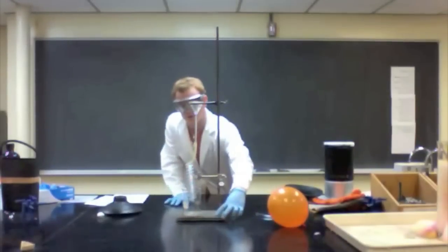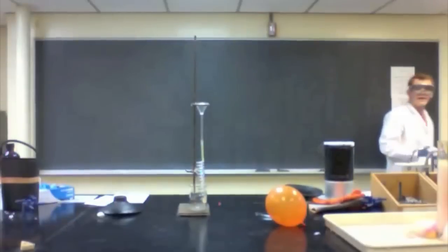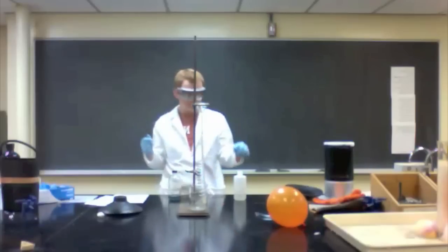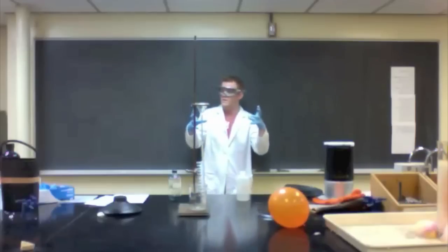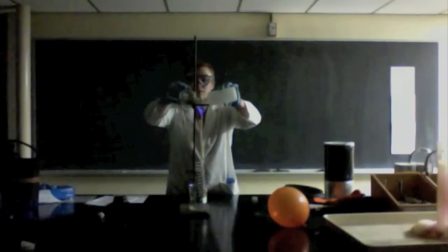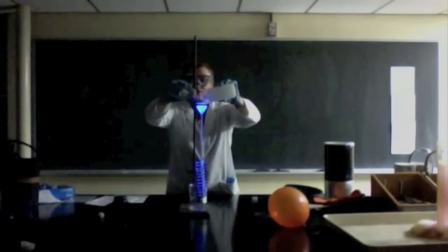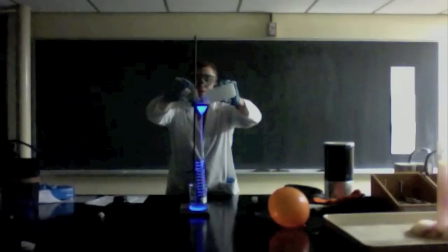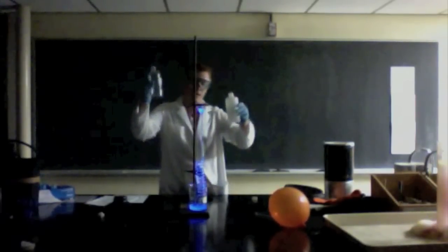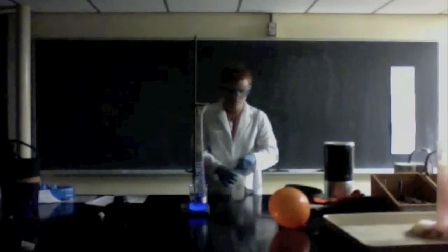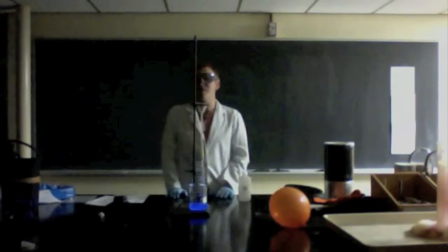And this is a pretty cool reaction. It's a very similar reaction to what lightning bugs do and also very similar to the glow sticks. Same sort of chemistry. What's happening is there are bonds breaking, bonds forming in this reaction, and during the process, some light energy. It's called luminol A and luminol B. I don't remember the exact components. I know this has peroxide in it, this has copper sulfate in it, and there's other organic molecules going to do the reaction.